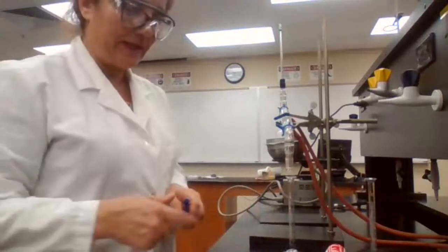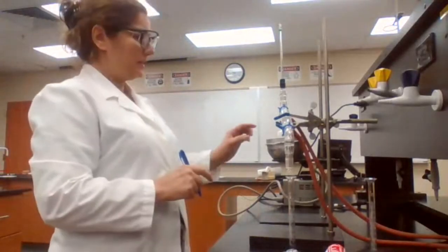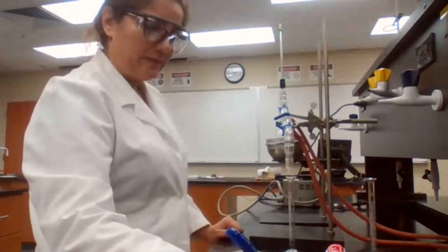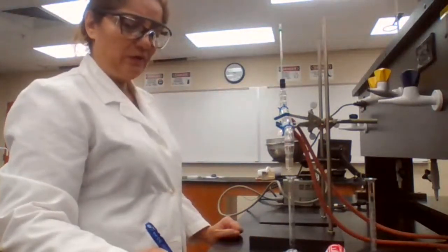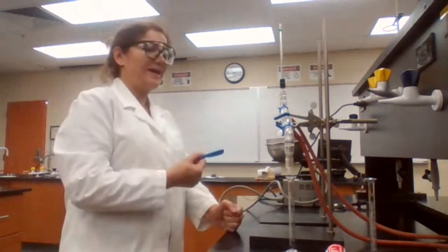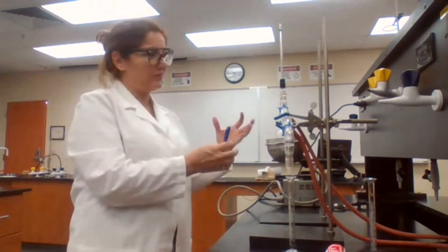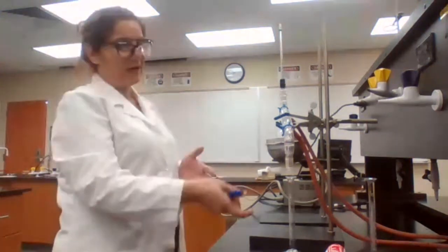You have your tables in your lab notebook created with volume versus temperature. I'm going to help you collect these data first before I set up the fractional distillation, because it's a fast experiment. Otherwise, usually when I have downtime, I can go ahead and set up the fractional distillation. But this simple distillation doesn't take too long for recovering the sample.